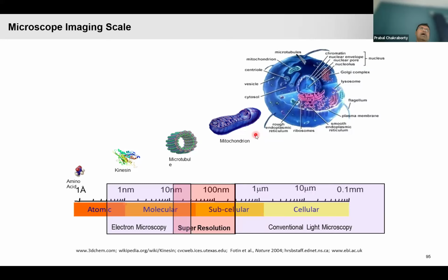And for that, I think in 2016, Stefan Hell and some other colleagues also got a Nobel Prize. So nowadays, super resolution microscopy is becoming much more familiar for application or for experimental purposes.